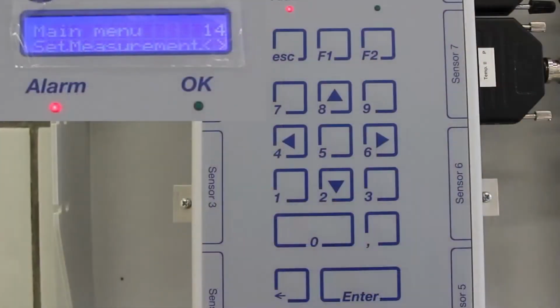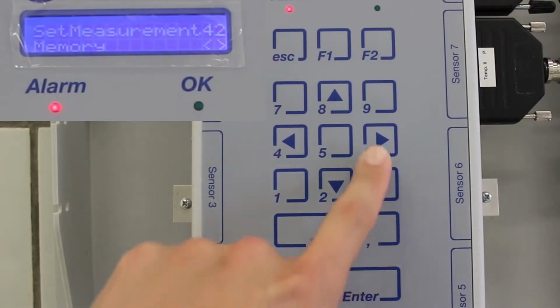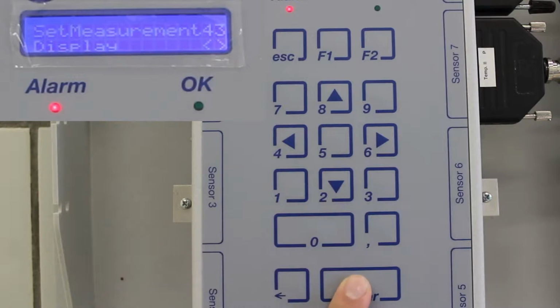In the main menu, select Set Measurement. Under this menu, find the option Display and press Enter. This determines the interval time between the information being shown on the display when programming is done and the equipment is in measurement and control mode. Once you've selected the interval time, press Enter and go back to Set Measurement.